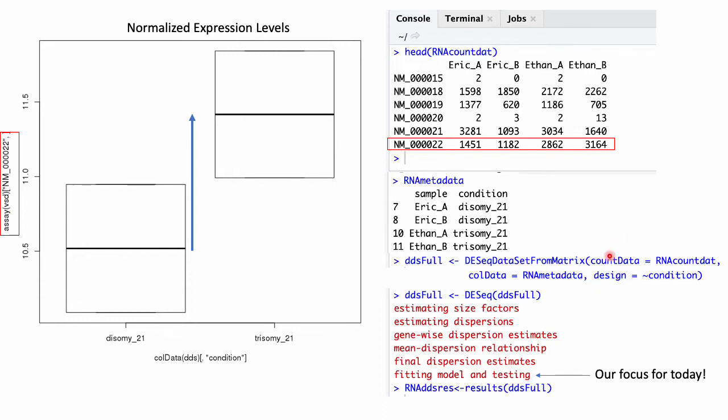In the last video, you focused on learning about the size factor and dispersion estimation steps. Here, we'll be focused on the model fitting and hypothesis testing steps.